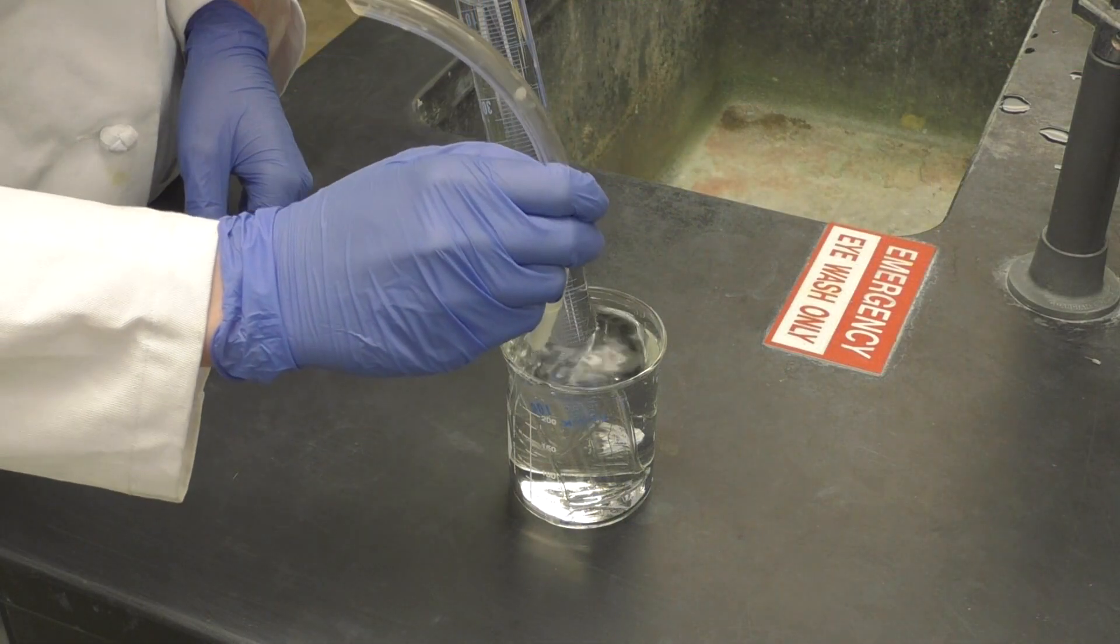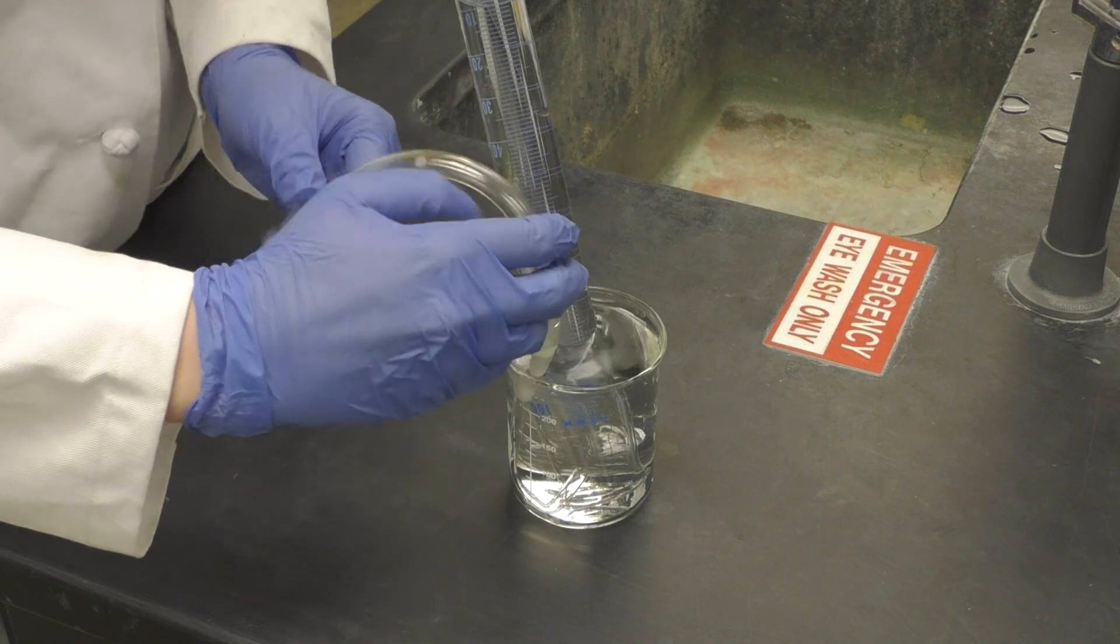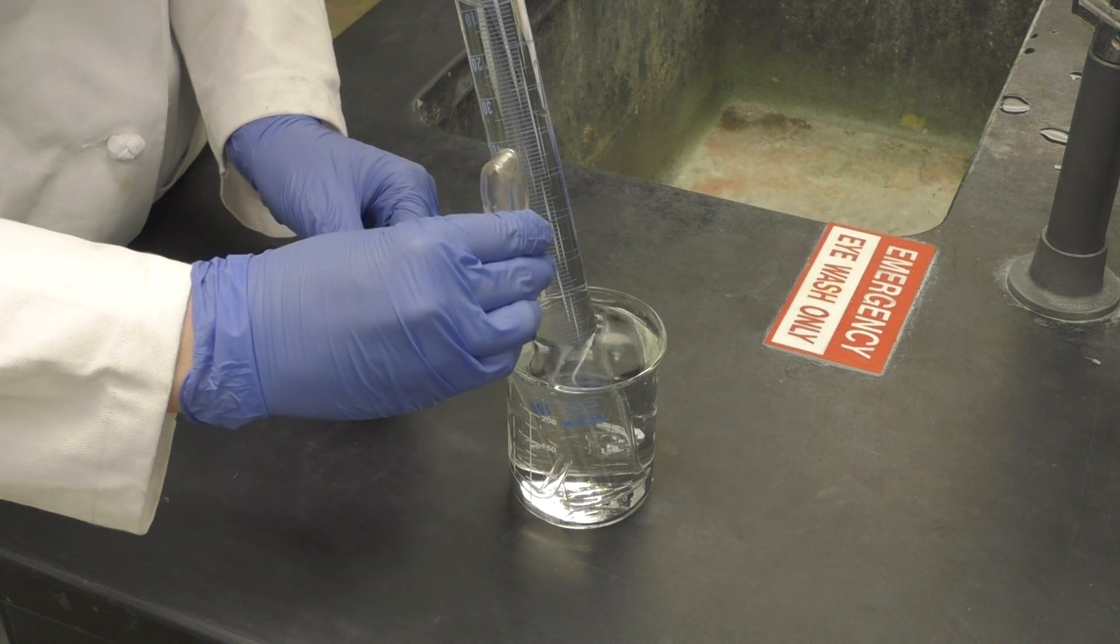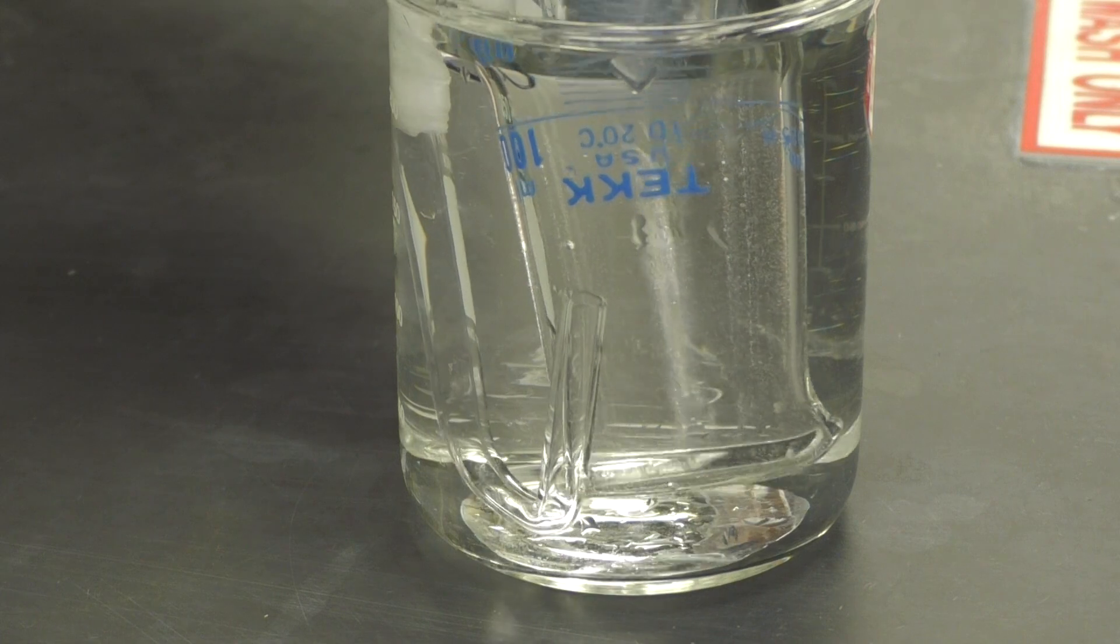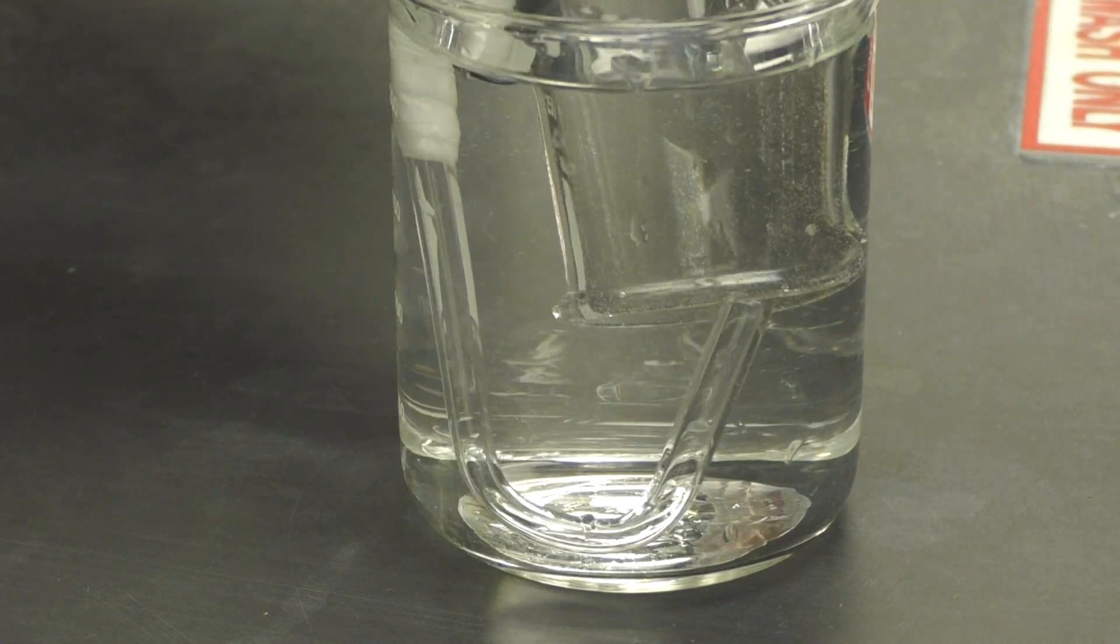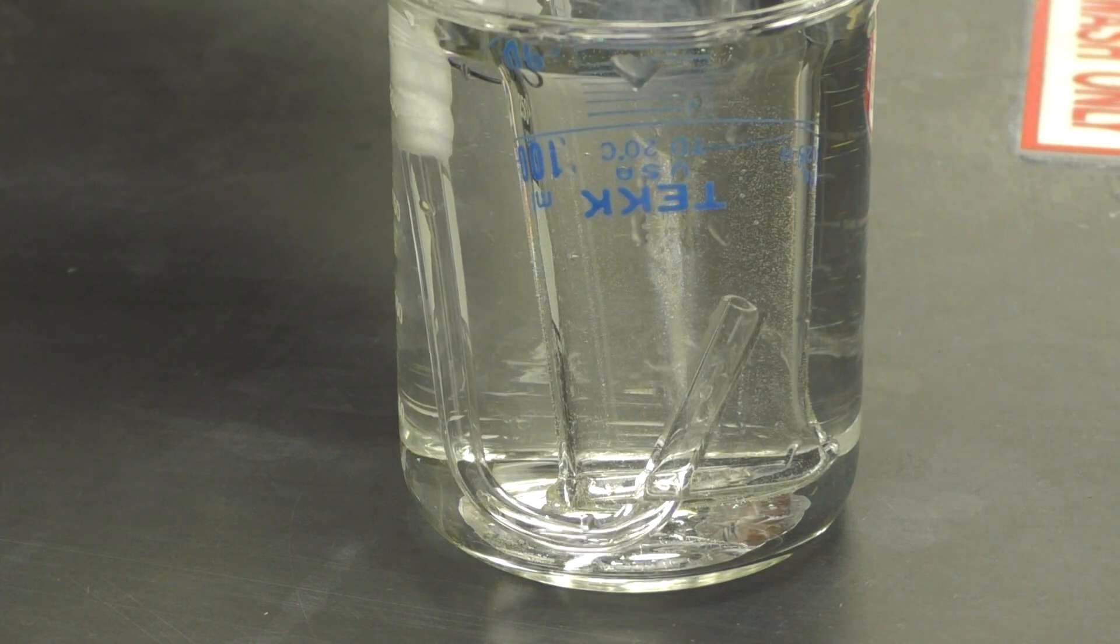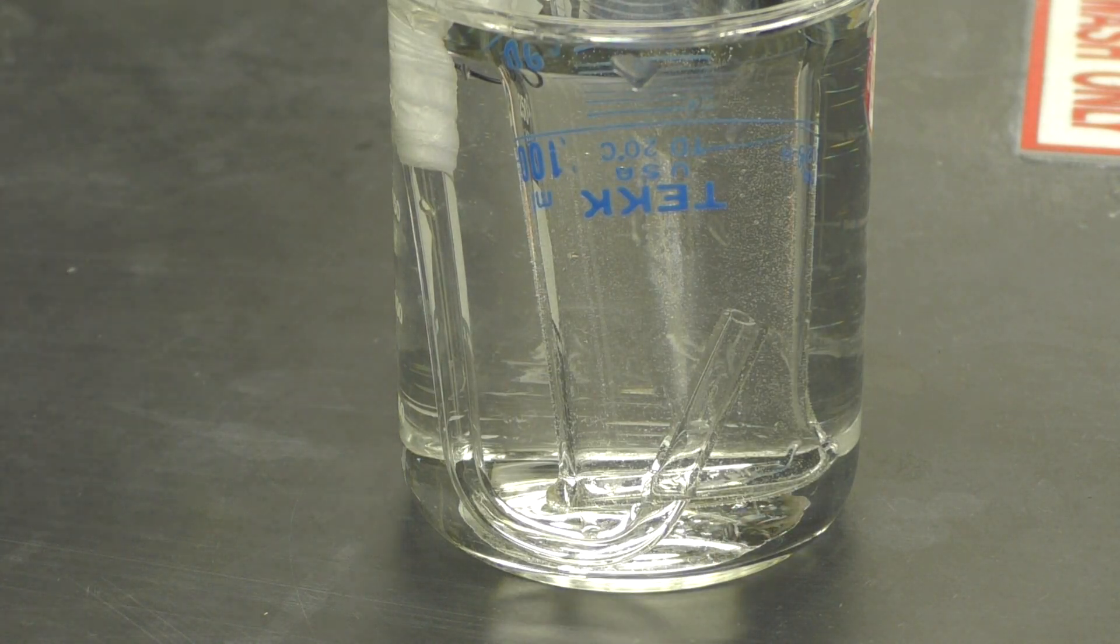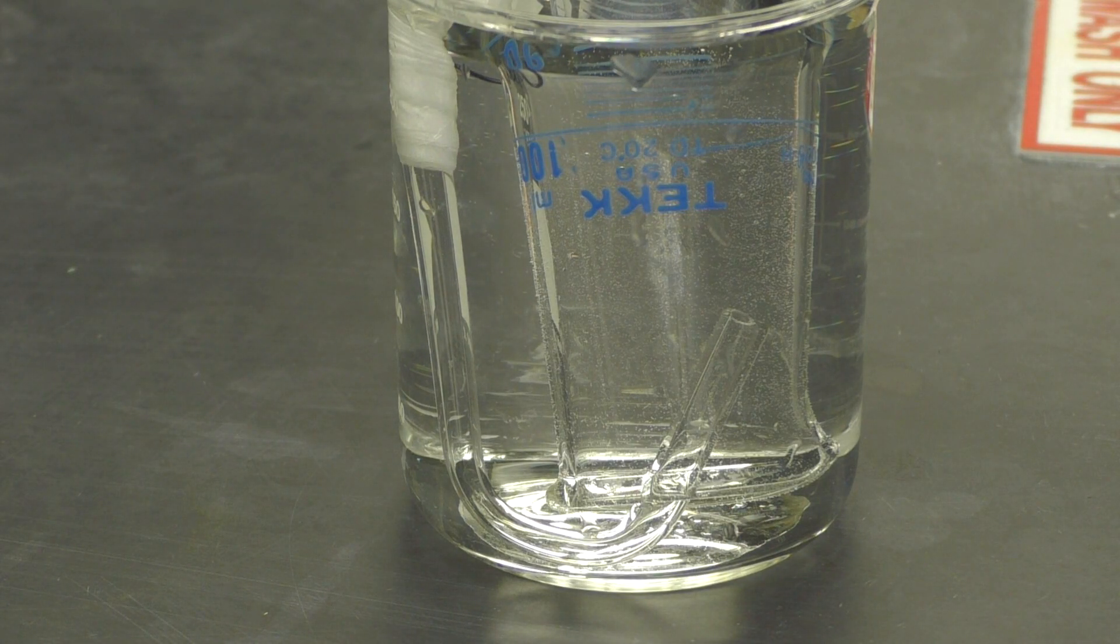Next, place your J-tube into the beaker and squeeze the plastic tubing once to remove some air from the tube. Then carefully raise the inverted graduated cylinder and slide the end of the J-tube into the opening of the cylinder. Try not to lift it too far as you may introduce air into the graduated cylinder.